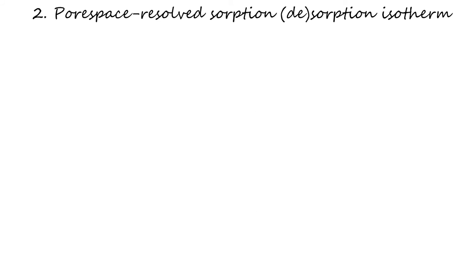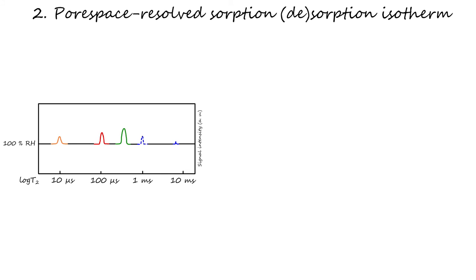On this slide, we consider the first desorption isotherm and how it is resolved in individual isotherms for each water population in the sample. In the video NMR-I, how to do the experiment, we have already shown how the total NMR signal can be split up into a spectrum like this. This example spectrum is a relatively mature sample equilibrated at 100% relative humidity.